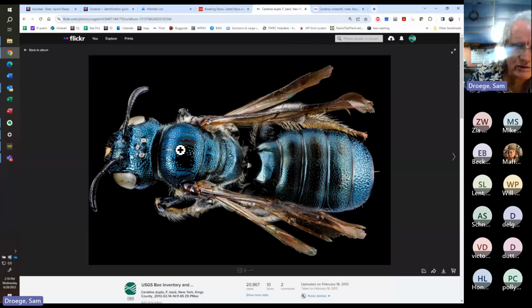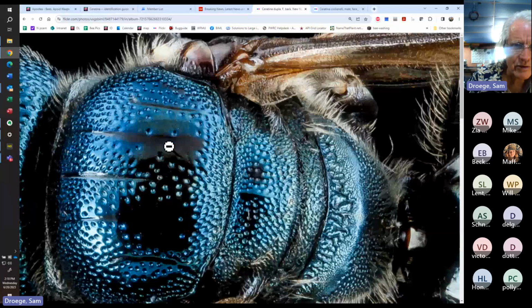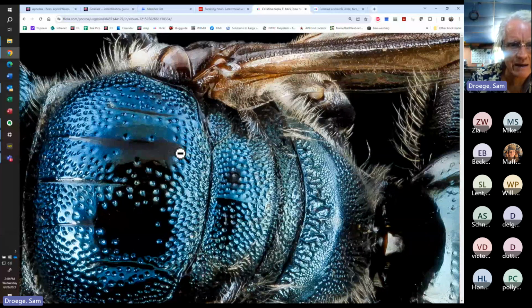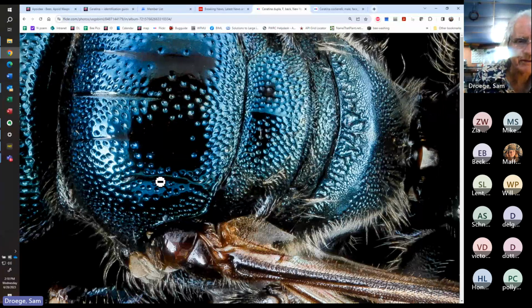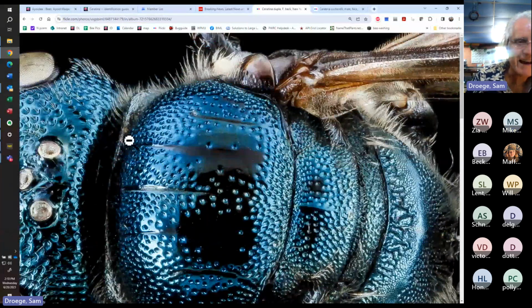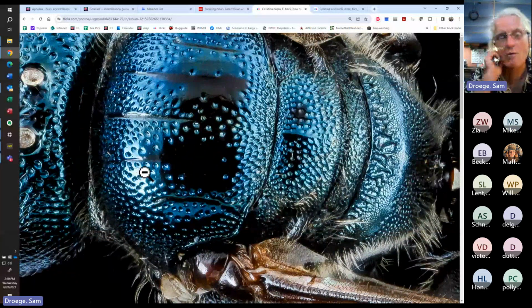So this, if we magnify this, yeah. So this is the parapsidal line right here. This is in Osmia. It turns into just like a slightly modified pit, it looks like, but basically they all have that. And here is the central line. And here's the mystery. We'll call them the Slater lines. Just randomly, which I have completely ignored. So yes, good point. I have no name.